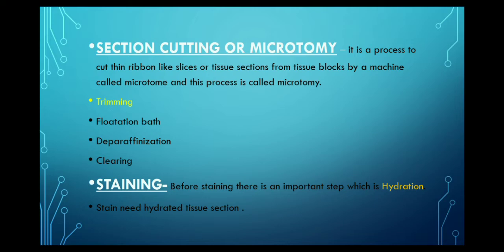After this, there is an important step which is deparaffinization. The sections which have paraffin on their surroundings go for deparaffinization by slightly heating the slides on a hot plate. After deparaffinization, slides are dipped in a xylene jar because paraffin wax is miscible in xylene, and we have to completely remove the paraffin wax. So we can remove this wax by xylene.